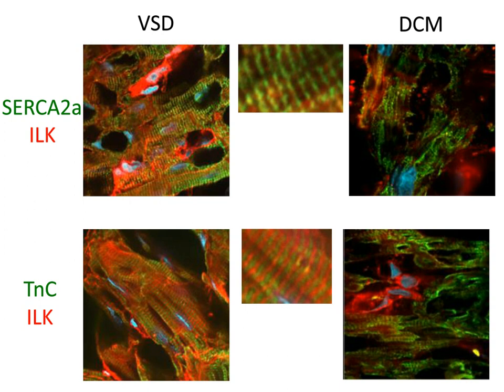So on the left-hand side, we have normal heart tissue. They're taken from pediatric patients undergoing heart surgery for ventricular septal defect, or VSD. So the contractility of that heart is fine. Those patients are not in heart failure. It's a small hole in the heart that has to be repaired surgically, but the function is actually fine.